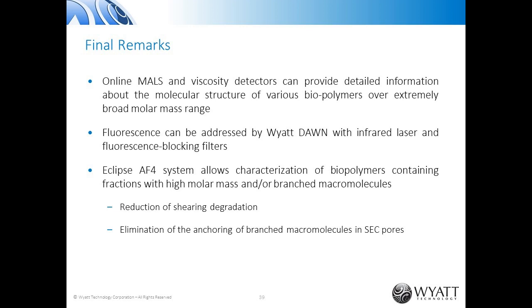And of course, when it comes to highly cross-linked structures, we still can measure molar mass, but actually it is not molar mass because we are not working with molecules anymore. We are just dealing with some supermolecular structures that some people call microgels. I would call them rather nanogels because they are in the size of several hundred nanometers. But AF4 would work for sure if you have such materials. If we have macroscopic gels, then they cannot be measured by any separation.